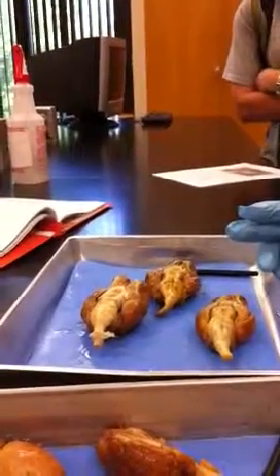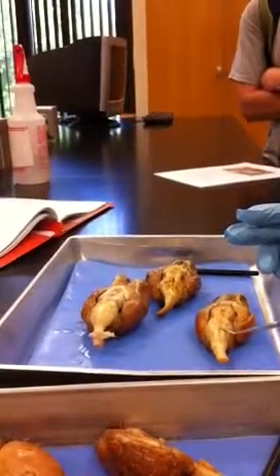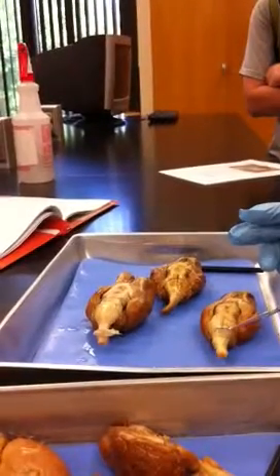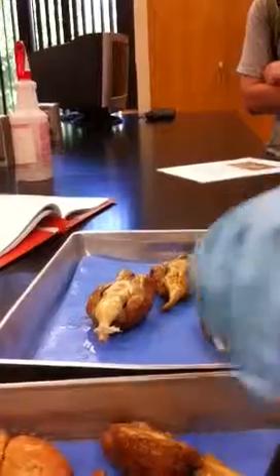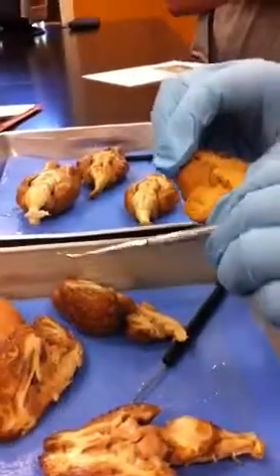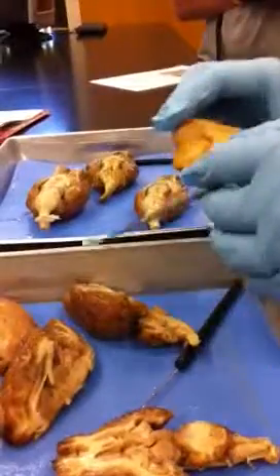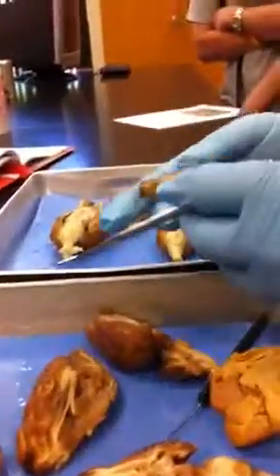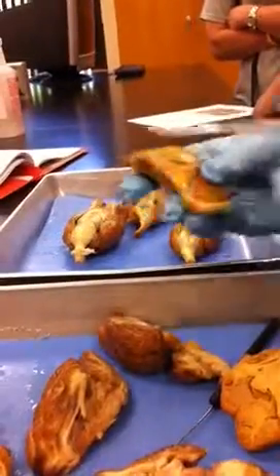So we've got the pons and the medulla oblongata. Remember that the spinal cord is anything after the medulla oblongata. As soon as the swelling goes away, you'll notice on these sagittal ones, they've dried out and they're not as bulky as those are, right? That's because they've actually lost a lot of water. Let me find a good one here. So they shrunk? Yeah, they shrunk.